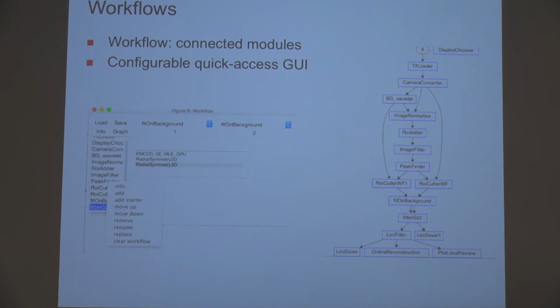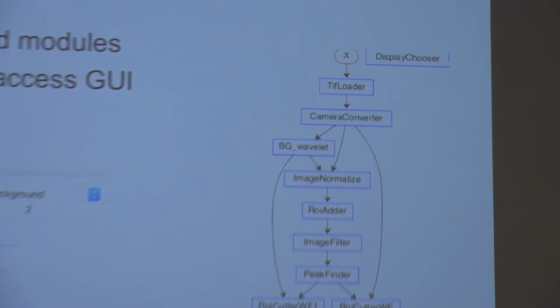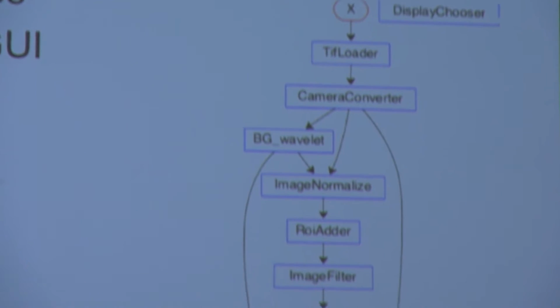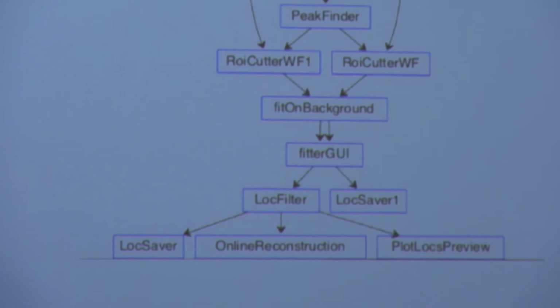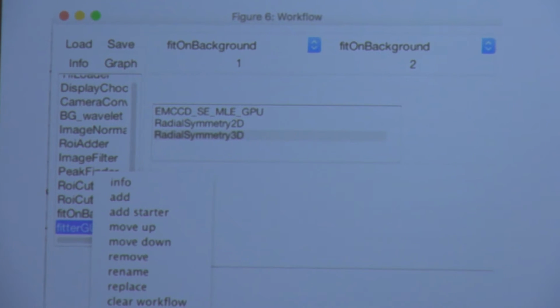So modules can then be connected into what I call workflows. It's really just a list of connected modules which run on the dataset one after the other. And we use those workflows especially for the fitting part. This is a typical fitting workflow we use. And the reason why we split up the whole algorithm into so many individual plugins is because that makes it very easy to exchange some part of the functionality without worrying about the rest.